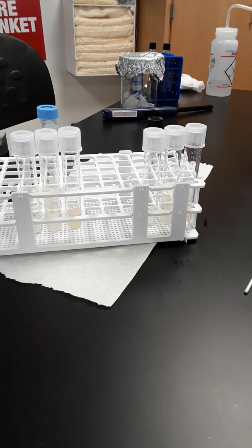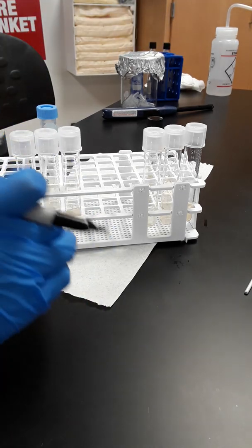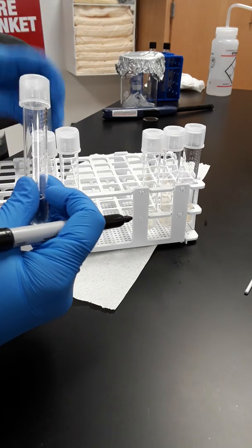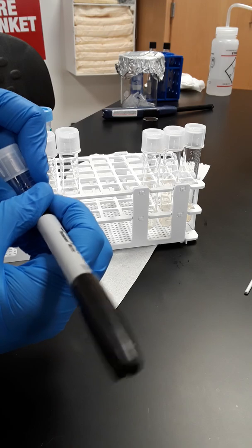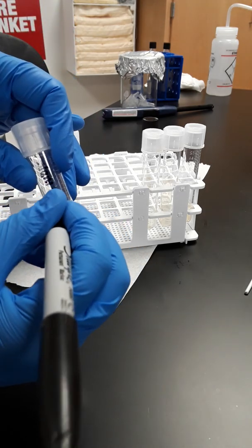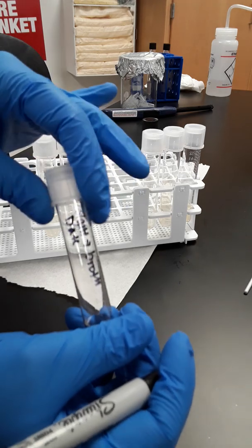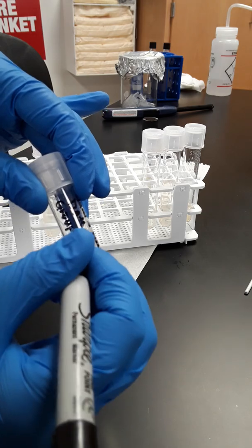Also, because we are transferring these things from two different sources, we're going to have to indicate that on our new tubes. So for example, this one's starting from a slant. So I'm going to say that this is slant 2, and this one's a broth. And then I'm going to put the date, whatever the date is. So slant to broth, date, your group identifier, group initials.